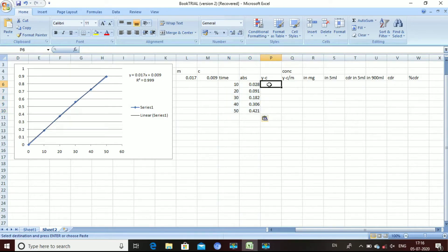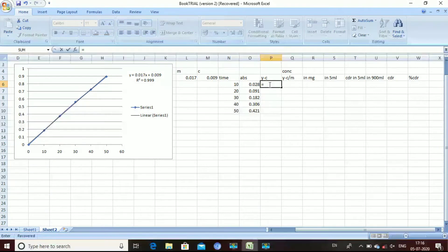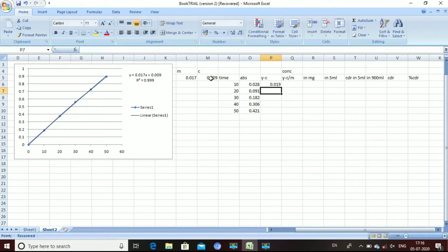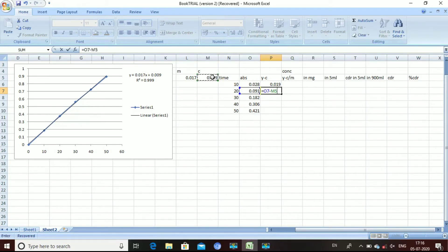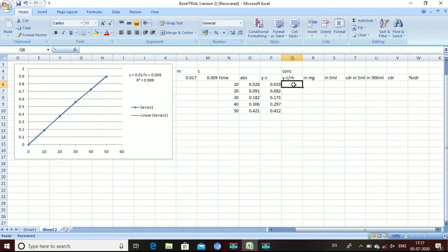In the y equals mx plus c equation, y is the absorbance and c is the intercept. For the first row, click on the absorbance value and subtract the c value, then press Enter to get the reading. For the concentration column, we calculate y minus c divided by m. Click on the y minus c value and divide by the m value to get the concentration.